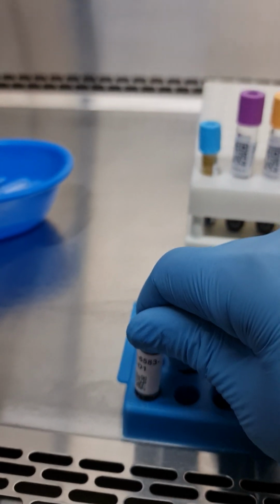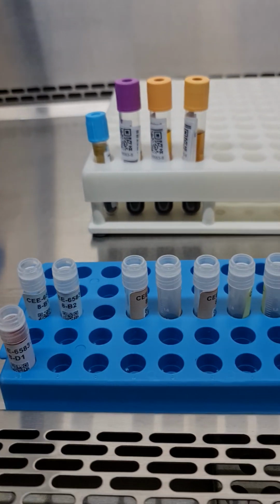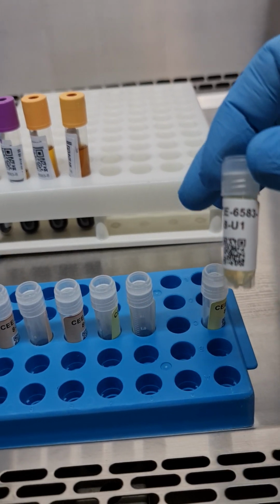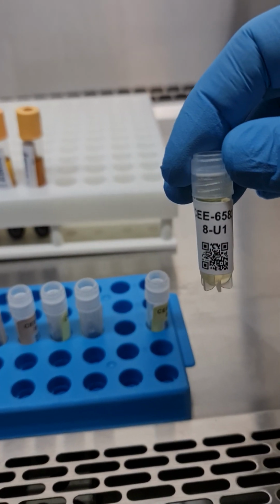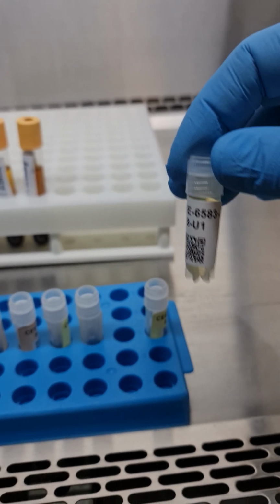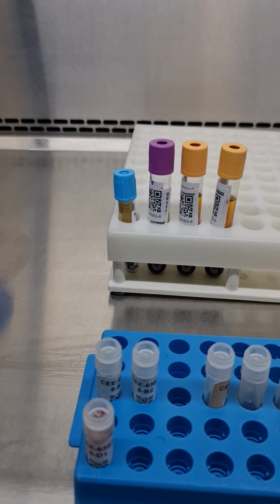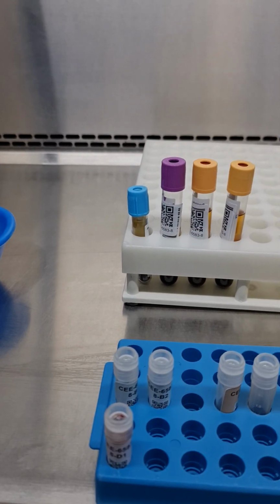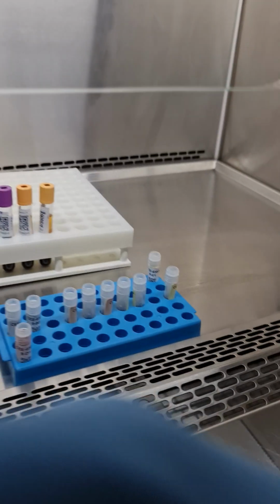As mentioned earlier, I have pipetted the whole blood in D1, and while the blood was spinning, I pipetted the urine sample 2 ml in U1 with the corresponding numbers. So now I'm going to pipette the rest of the sample within the cryotube.